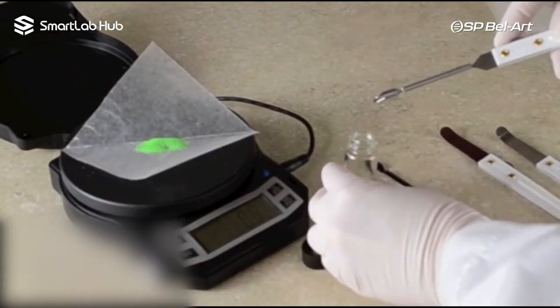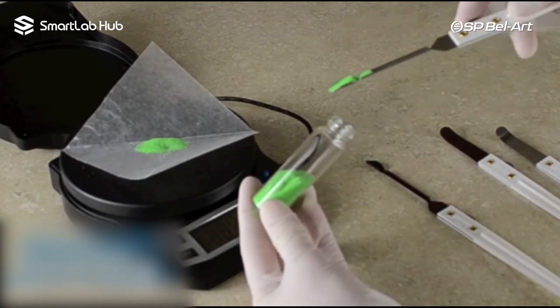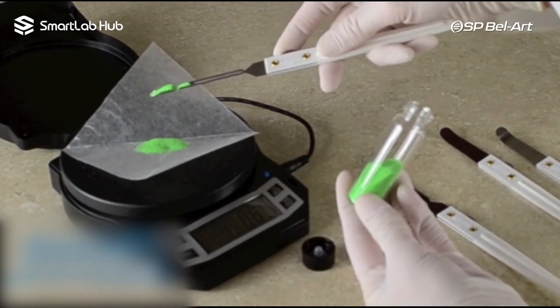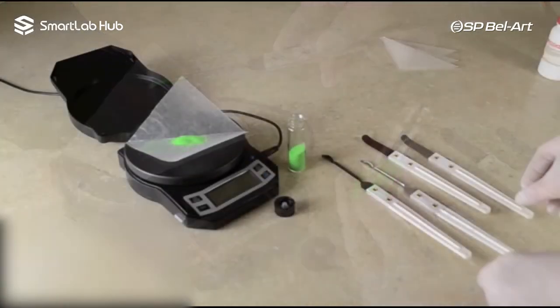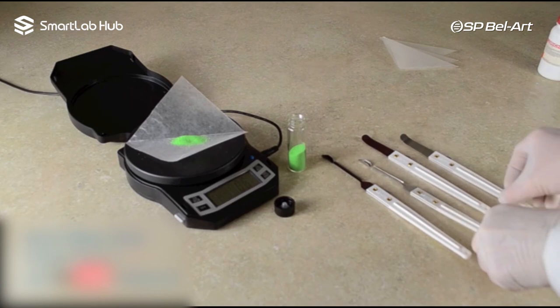The Quaverette offers those same features, but its narrow v-shaped blade maneuvers easily into small mouth containers and tight corners. Both are available with either a stainless steel blade or with Teflon FEP coating.